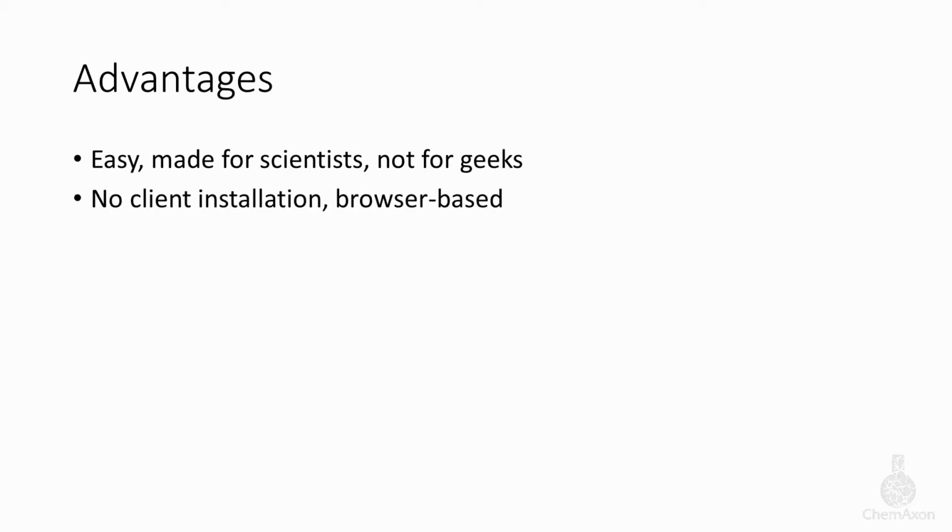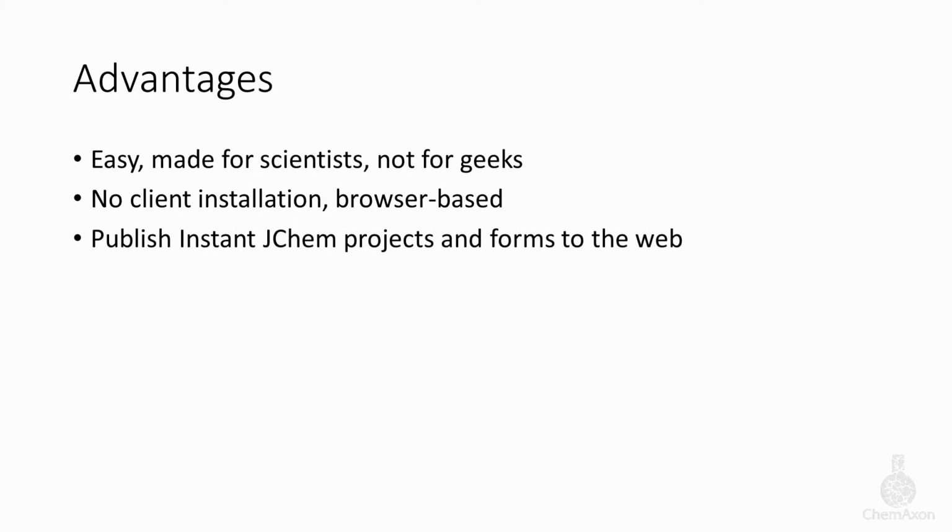There is no need for a client application. Plexus Connect runs in a web browser, Firefox, Chrome, or Internet Explorer 10 or higher, as it has been written in pure JavaScript. Nothing is needed on the client side, just a web browser. And if you already have databases in the popular Instant JChem application, you can publish them directly on the web in minutes.